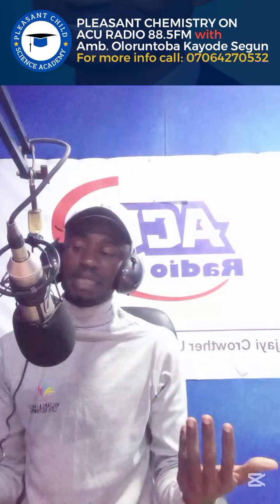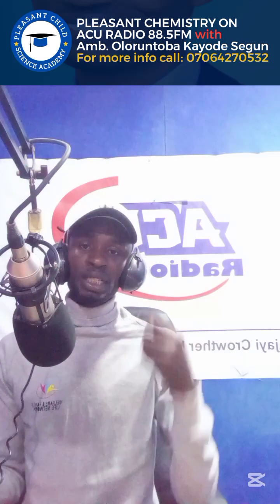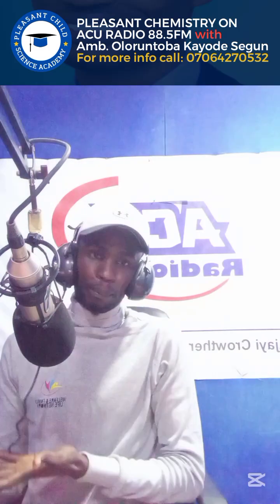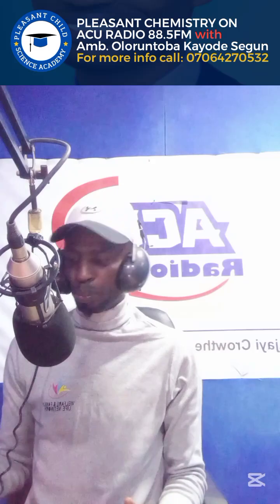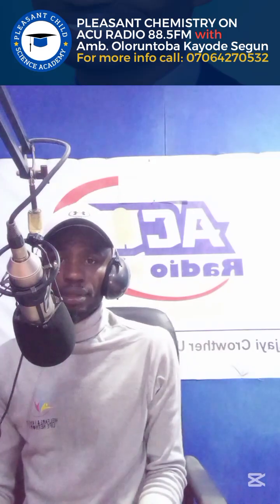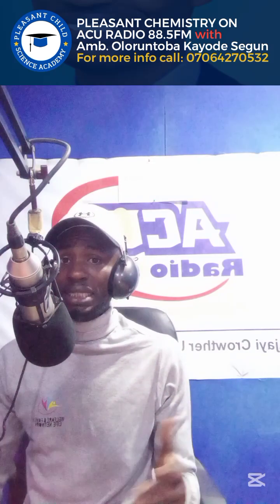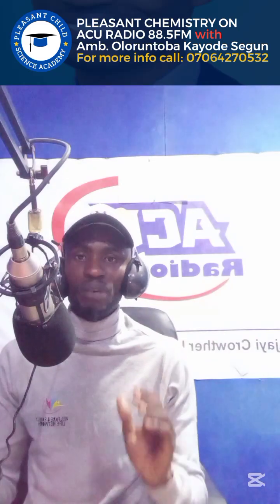So if you are using 3 titers, that means that if your first titer is 22.2, the next titer is 22.3, the third titer is 22.4, you can pick the 3 titers because the differences between them are not more than 0.2. If you pick the 3 like that, you divide by 3. By doing so, you have calculated the average volume of acid used.